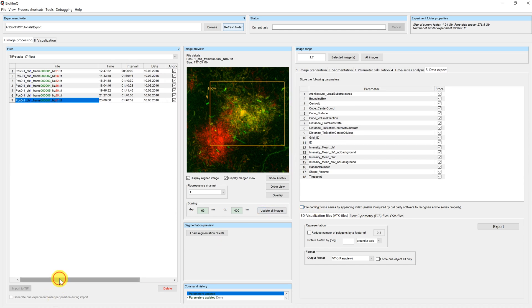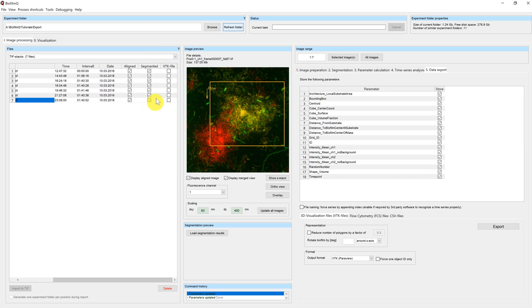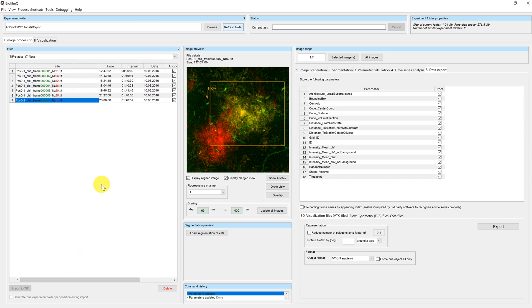Here I have a time series which is already segmented. In previous tutorials we extracted different parameters from this time series. You can find the download link for the raw dataset on the Biofilm Q website.